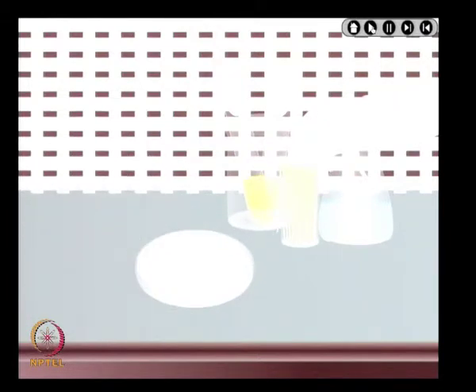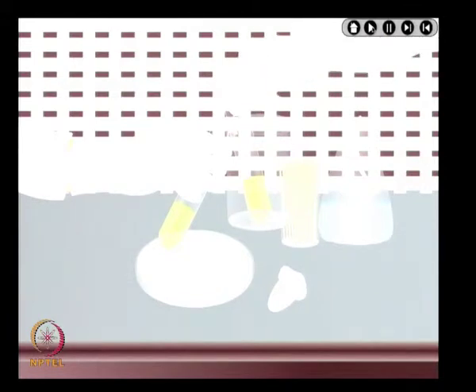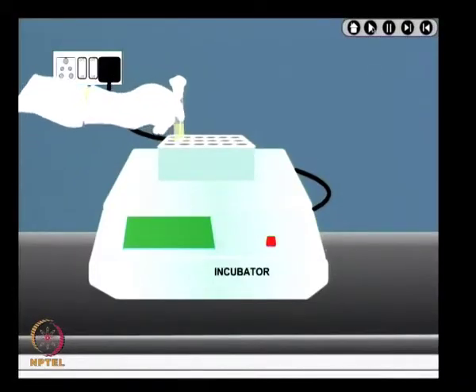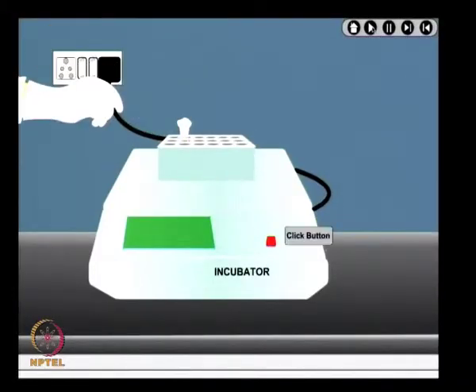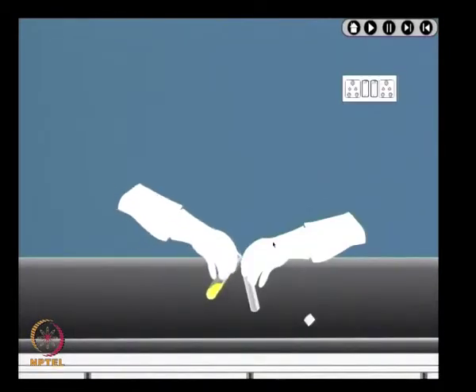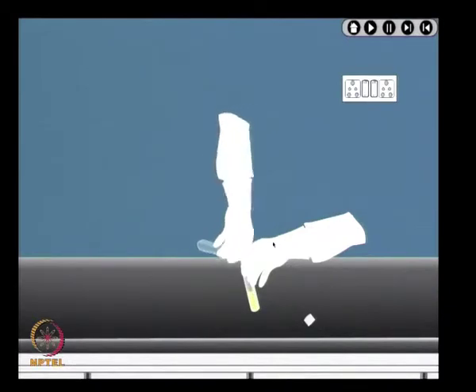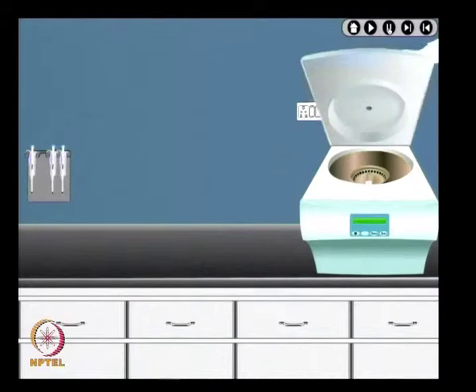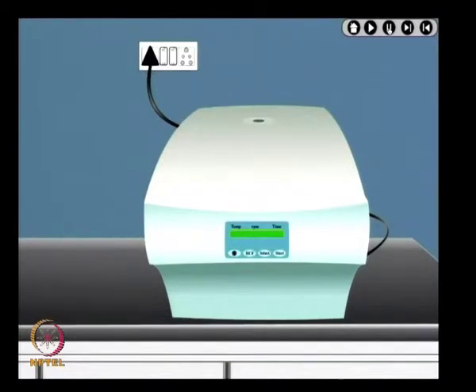For any bacterial proteome analysis, first you need to grow the bacterial cultures on LB media containing suitable antibiotic. Now, the proper 37 degrees temperature is provided for overnight or 6 to 8 hours of growth. The overnight cultures are diluted with fresh LB and grown at 37 degrees for 6 to 8 hours. Continue growing the culture till it reaches the mid exponential phase.